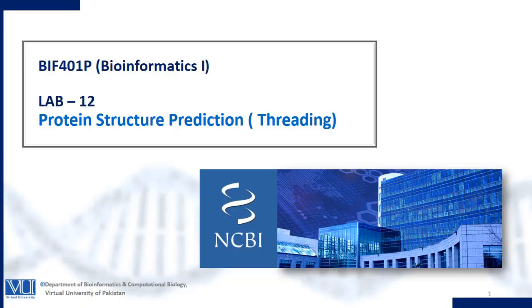Hello and welcome. In this lab session, we will learn how you could predict the protein 3D model or structure by using the threading algorithm. As we already discussed previously, for the prediction of protein structures we have different algorithms, but so far I-TASSER is considered a more efficient program due to its high accuracy prediction.